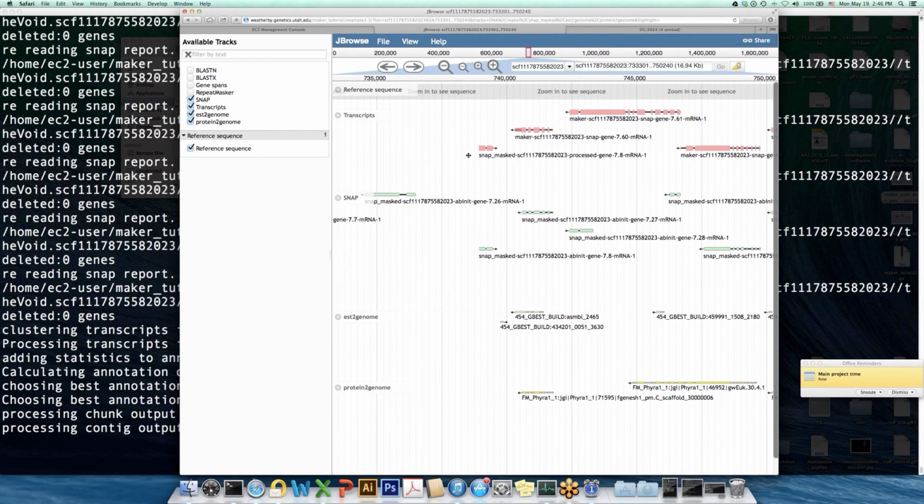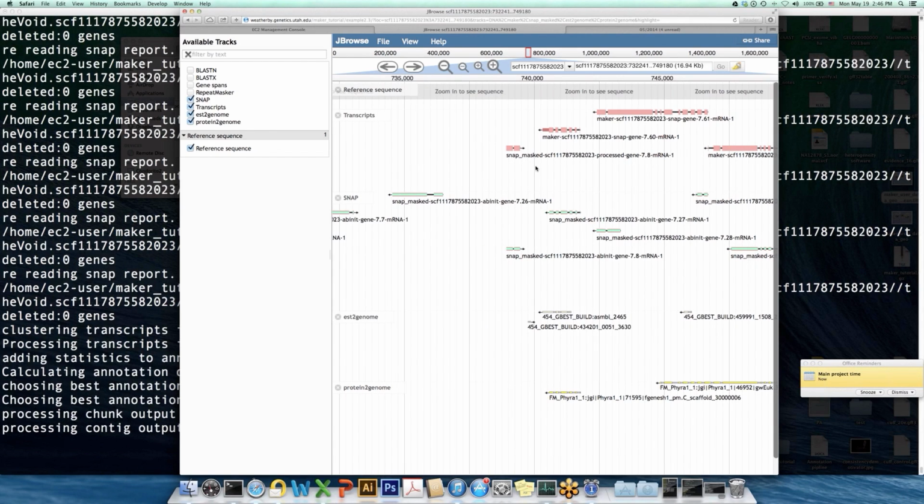Okay, but that's generally how you at least get started with a new genome project. You need to produce some rough gene models to train your gene predictor, and then with at least one layer of bootstrap training, you should be able to move towards final annotation.